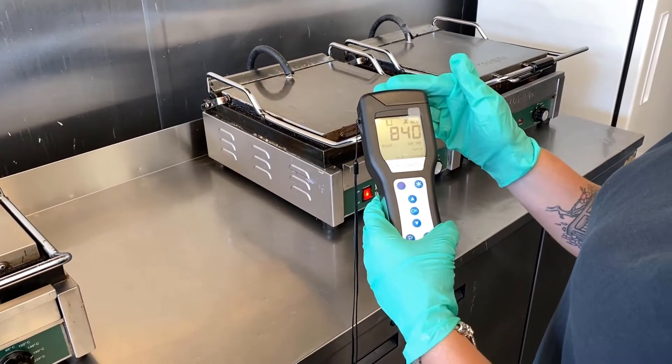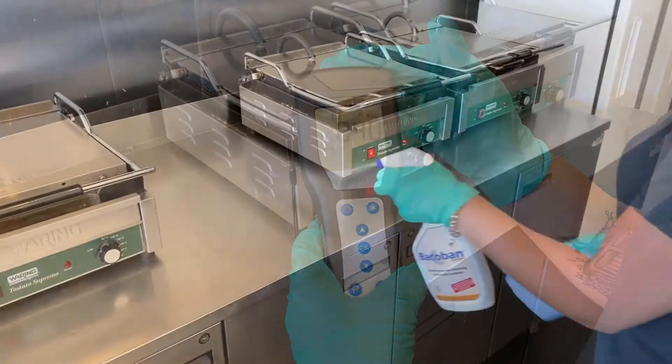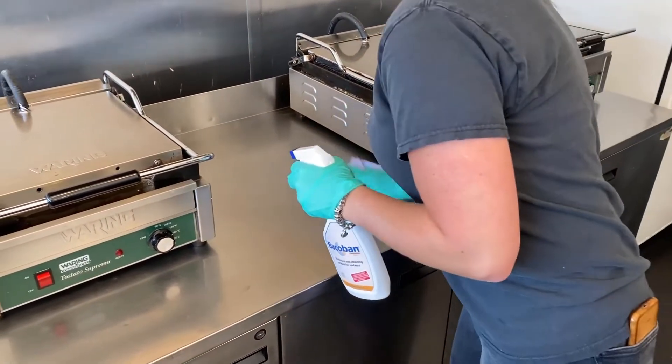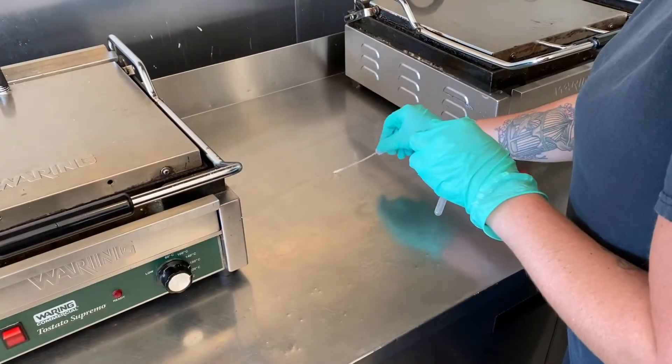This test shows 840 Relative Light Units, or RLUs, and the higher the number, the higher the presence of bacteria and viruses. Immediately after the first test, we got our client to clean the work surface again, only this time she was using Bacoban.